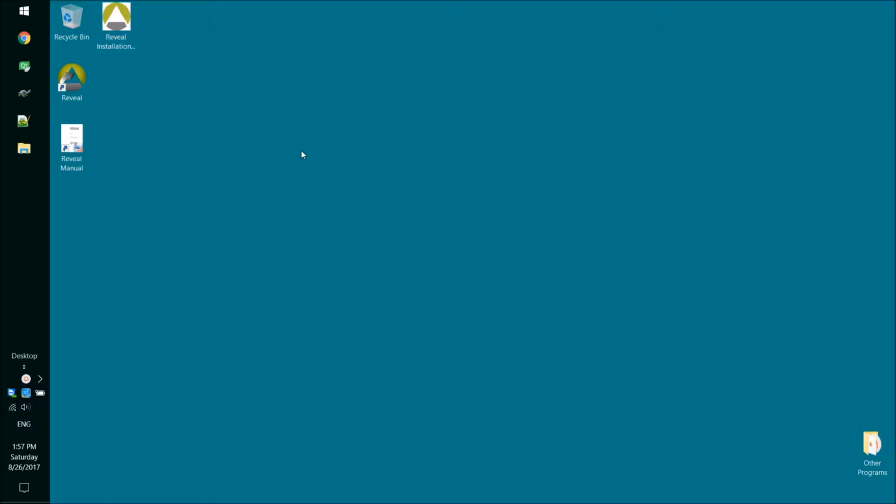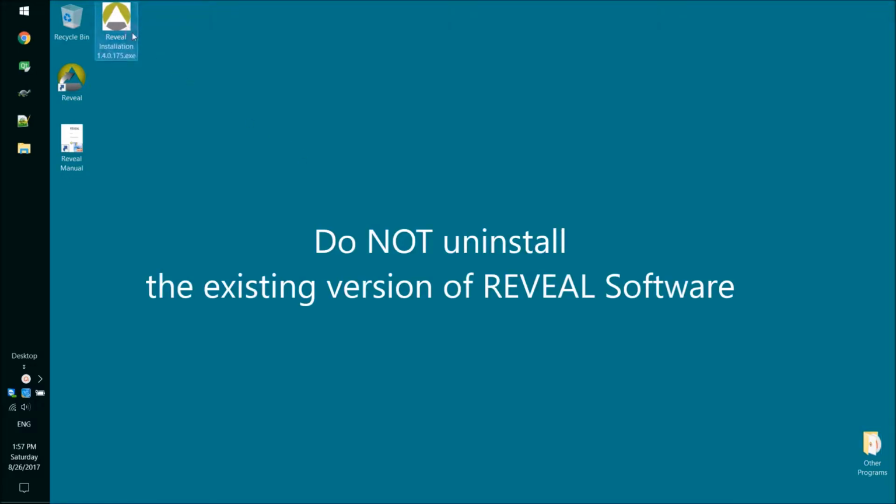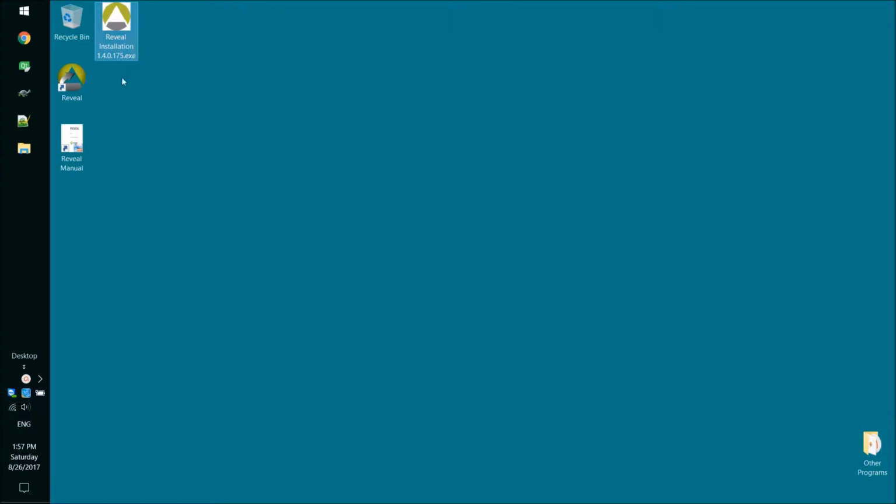Please do not uninstall the existing Reveal software. By uninstalling, all configuration files will be lost. Start by launching the installation program.